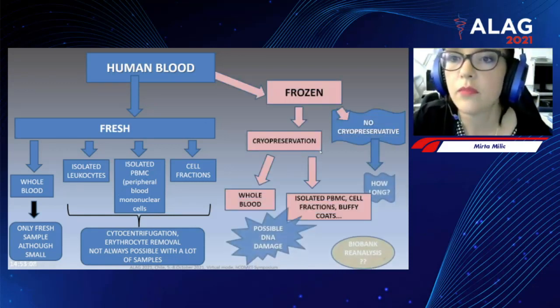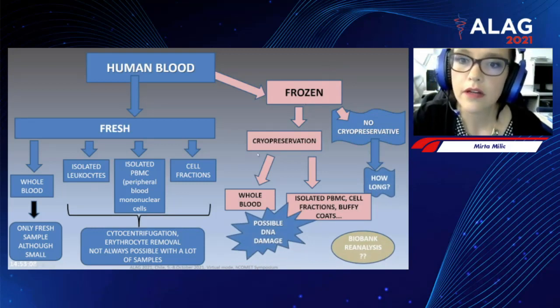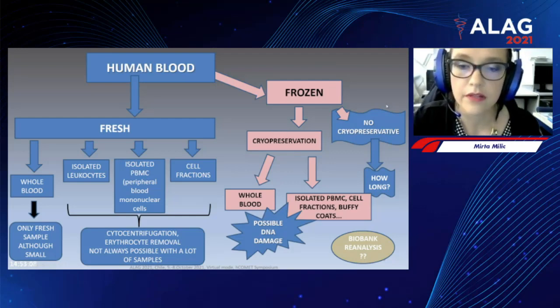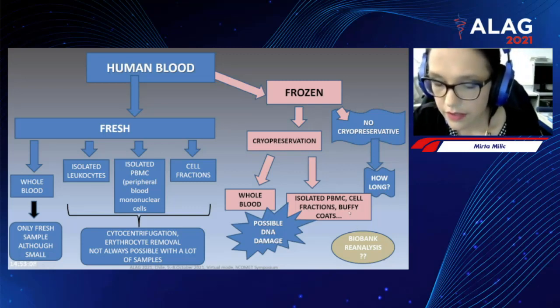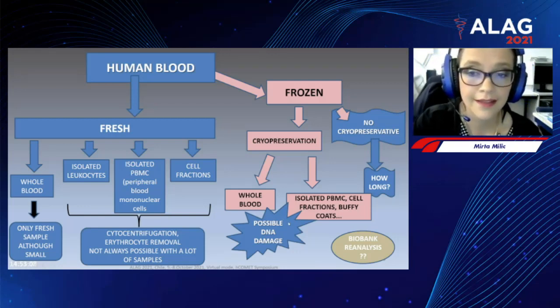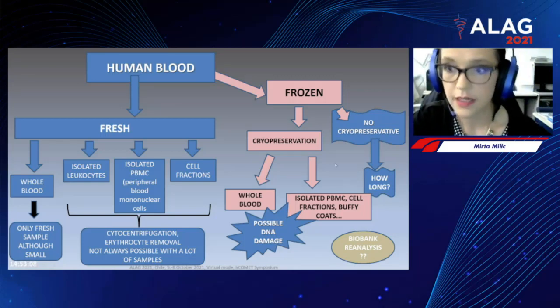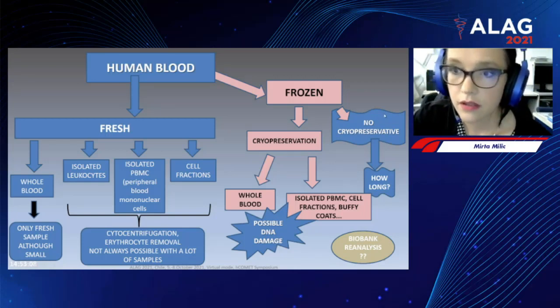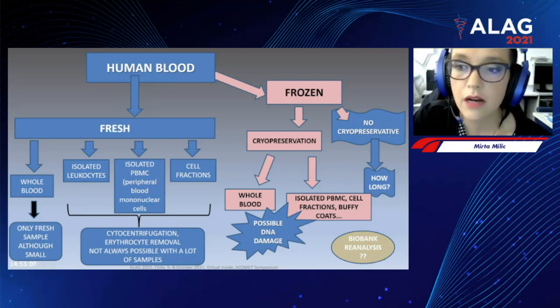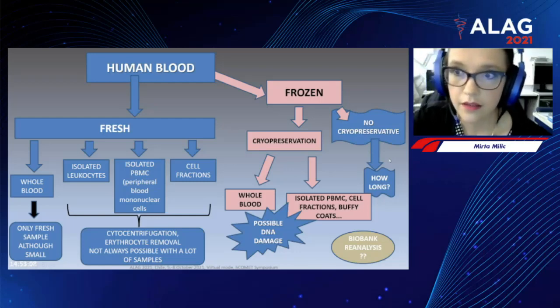So sometimes it could be better to use frozen samples, with or without cryopreservation. You can use whole blood or isolated fractions, but when using cryopreservation there is the possibility of DNA damage when you compare the results with freshly used samples. And if you are using no cryopreservative, we don't know for how long those samples can be stored without DNA damage, and there are not many articles about that.